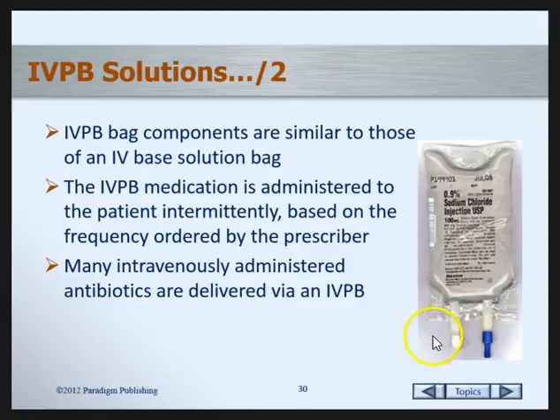On the injection port, you have an outer rubber diaphragm through which you will insert your needle, and then when you're putting it through the bag, you're going to feel a little bit of resistance as the needle passes through that more hard plastic diaphragm into the shaft of the injection port. When you remove the needle, the rubber diaphragm on the injection port end self-heals so it won't leak out. If you were to puncture the hard diaphragm on the tubing port, but then were to remove either the spike or a needle, it would have an opening that would just drip through.